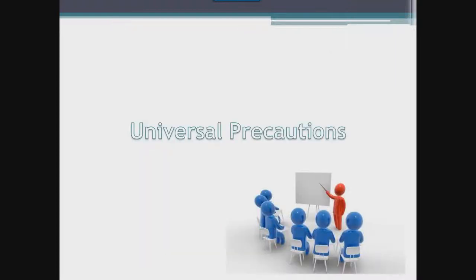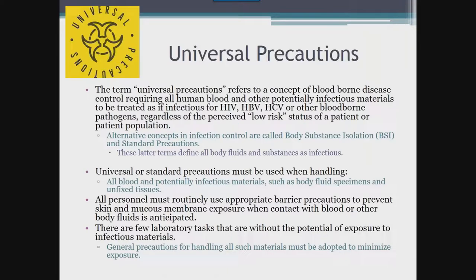So what does it mean when we say that we follow universal precautions? This is an important concept that anyone in the laboratory should fully understand. The term universal precautions refers to a concept of bloodborne disease control requiring all human blood and other potentially infectious materials to be treated as if infectious for HIV, hepatitis B or C, or other bloodborne pathogens, regardless of the perceived low risk status of a patient or patient population.